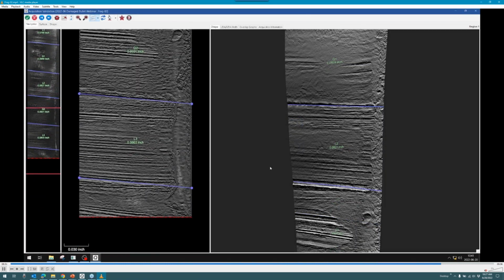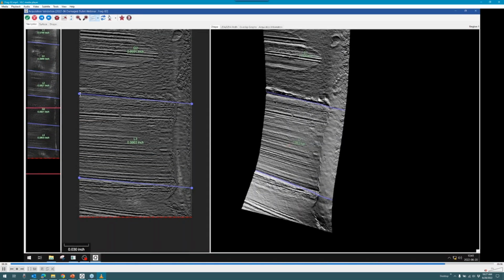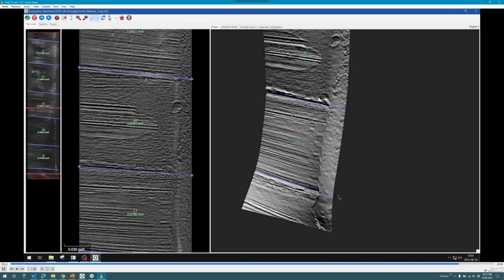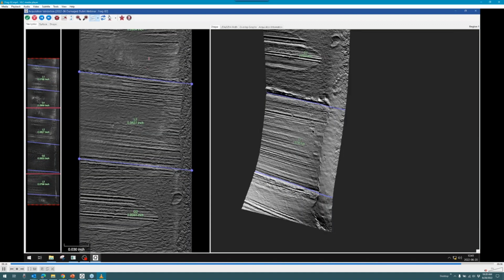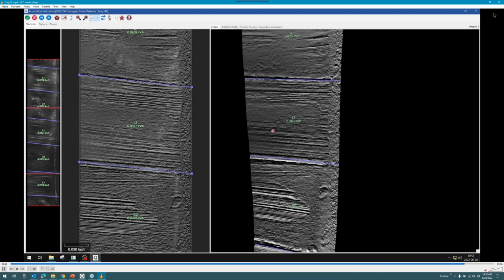Here is getting a closer look at the tail end of this acquisition, where you can see that exaggerated reverse curve that this actually had, but the system had no trouble maintaining the perpendicularity throughout that to get the quality scan of the information that was on that surface. These are things that Quantum and IBIS do all on their own. So with the anchor lines validated, that is the second fragment acquired. Let's close this window here.